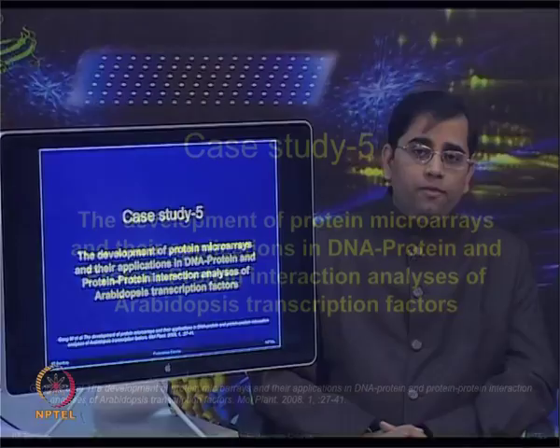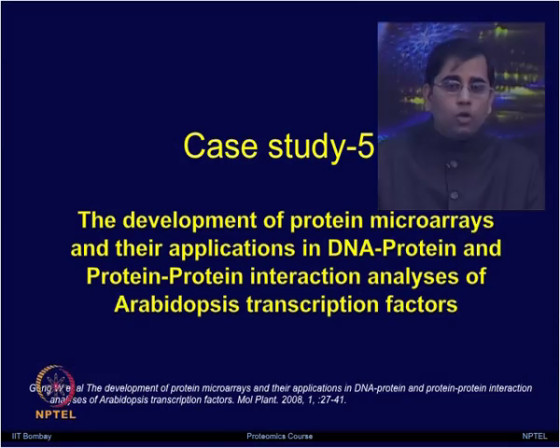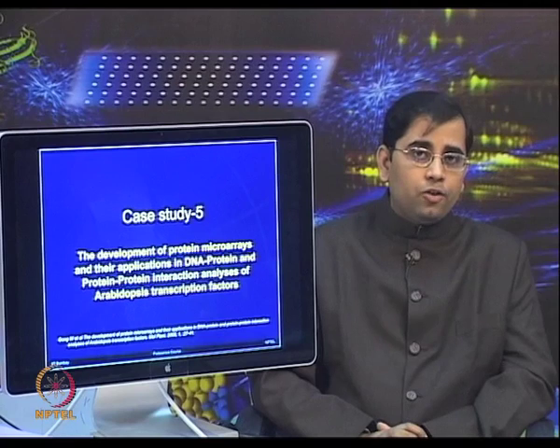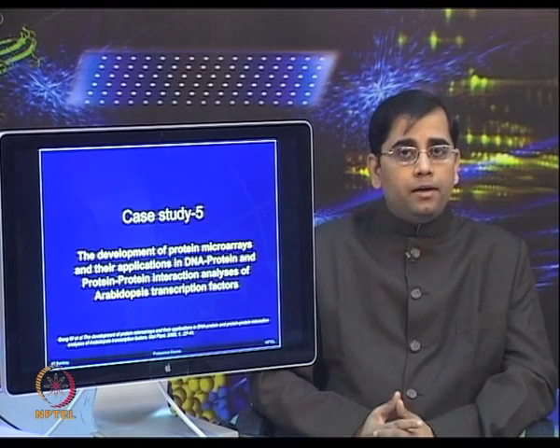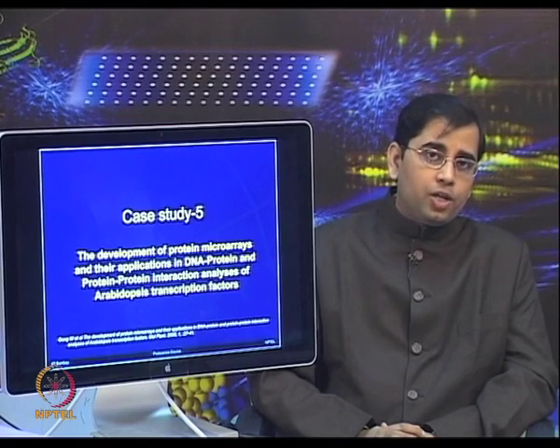So, let us discuss case study 5, the development of protein microarrays and their applications in DNA-protein and protein-protein interactions, analysis of the Arabidopsis transcription factors. The study by Gong et al. So, transcription factors play a very crucial role in cellular and developmental processes of any organism including plants. So, in this study authors generated an ORF expression repository and then used that system for generating the protein microarrays based on the transcription factors of Arabidopsis.